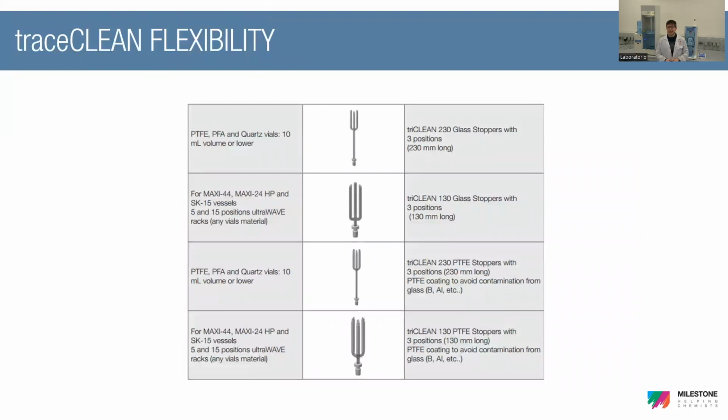Then, as I said before, as you can see from the camera, any kind of materials, any kind of glassware, including digestion vessels and flasks, can be placed on the system, since it is equipped with 20 positions, 20 rods, to place up to 20 different glasswares.